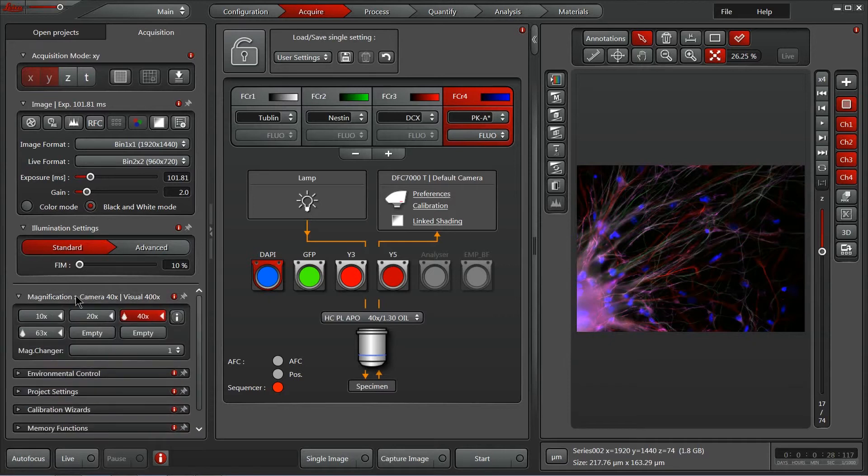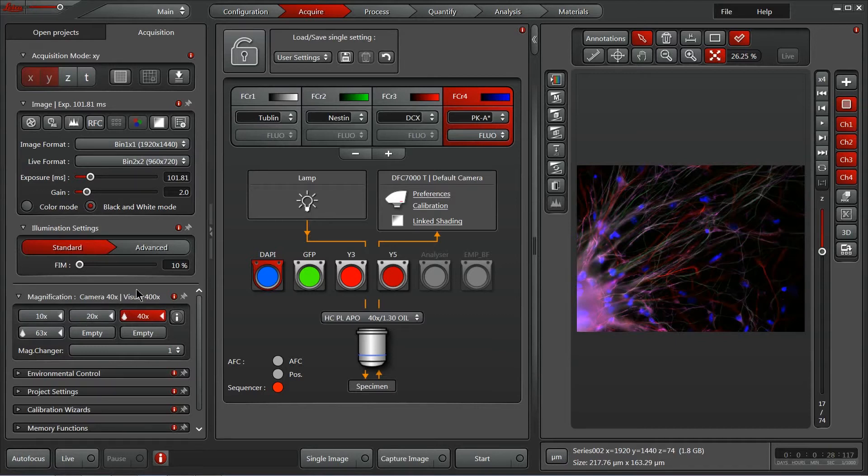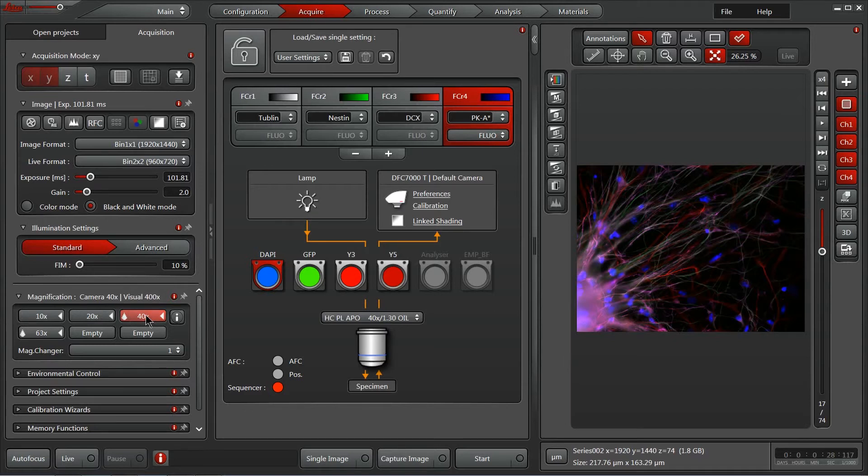We also have our magnification control. Since there's a motorized nosepiece on this microscope, I can click and change between different objectives. Some systems aren't motorized, but are encoded, in which case you'll be able to easily see your objective being displayed here, that you'll have to reach over to the scope and manually change them.